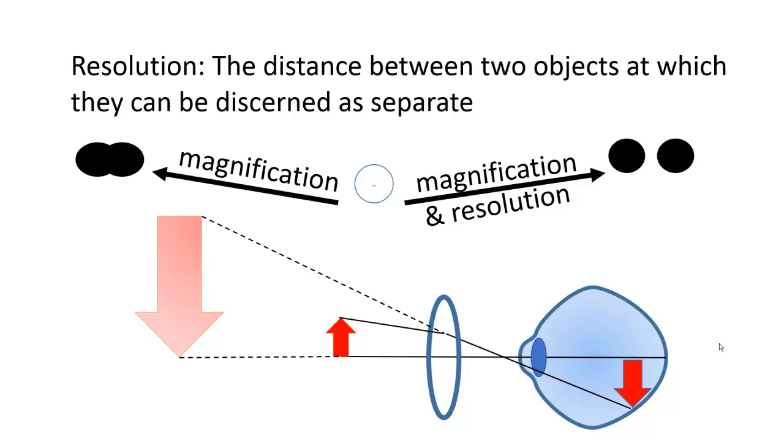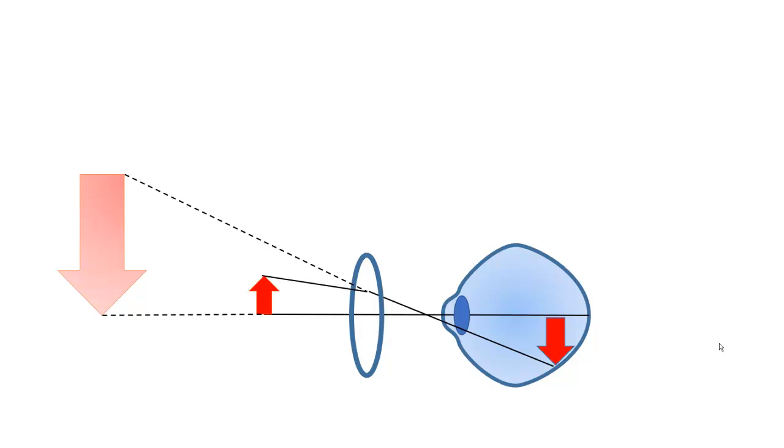So all of our lens systems that we're going to use are going to have a finite limit on resolution, and that's really down to physics. So there's a few factors involved in determining the resolution limit of a lens system. So let's look at those factors. Okay, the first thing we have to take into account is the wavelength of our illumination radiation. In our case, it's going to be light. So we're looking at the wavelength range of visible light. We're looking at the visible spectrum.